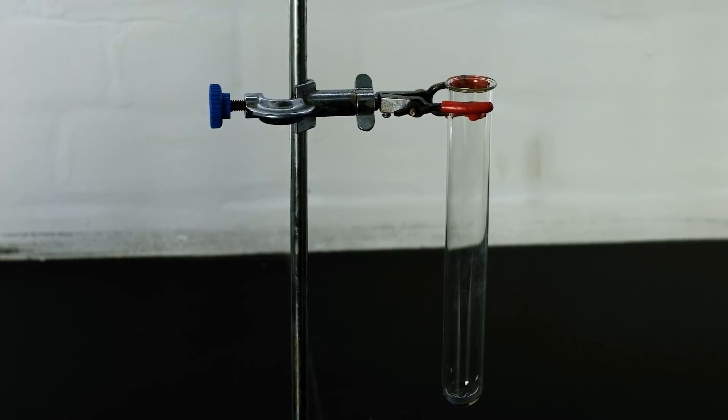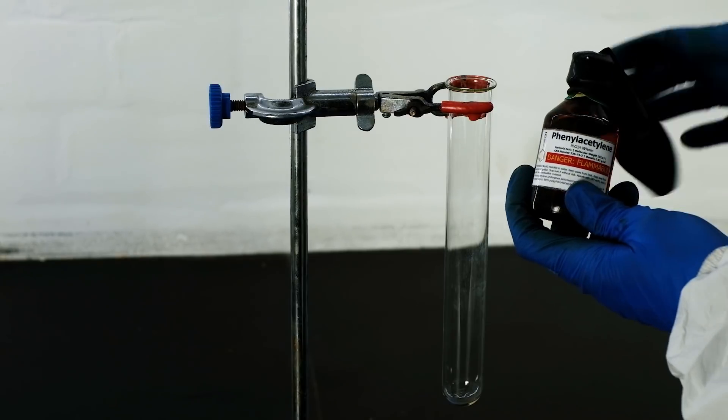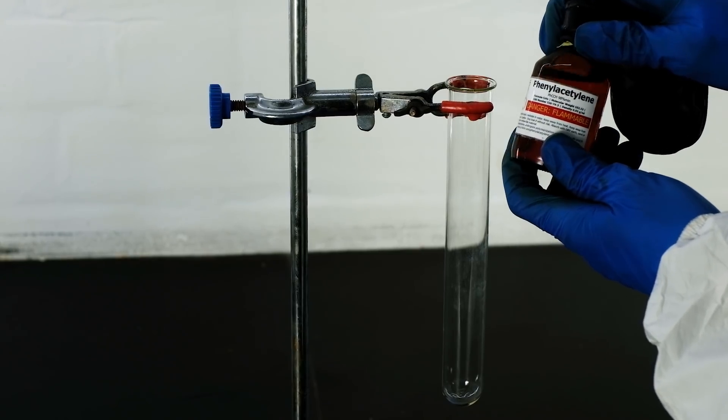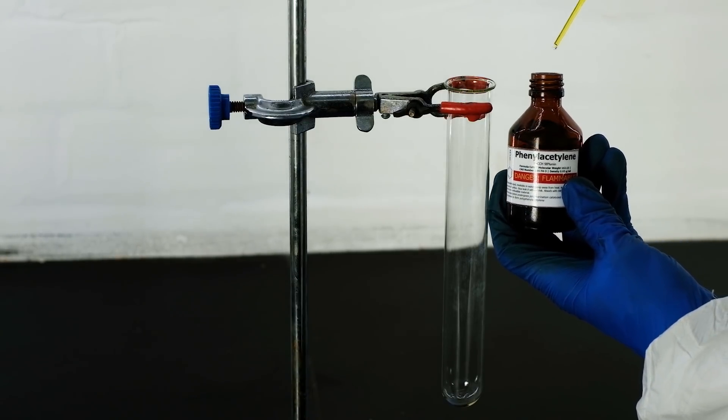In this experiment, we will chlorinate phenylacetylene. Phenylacetylene has an unsaturated bond and like other alkynes, can be chlorinated. Phenylacetylene is a very stinking volatile liquid, so to store it in the lab, an additional cap is sometimes put on.